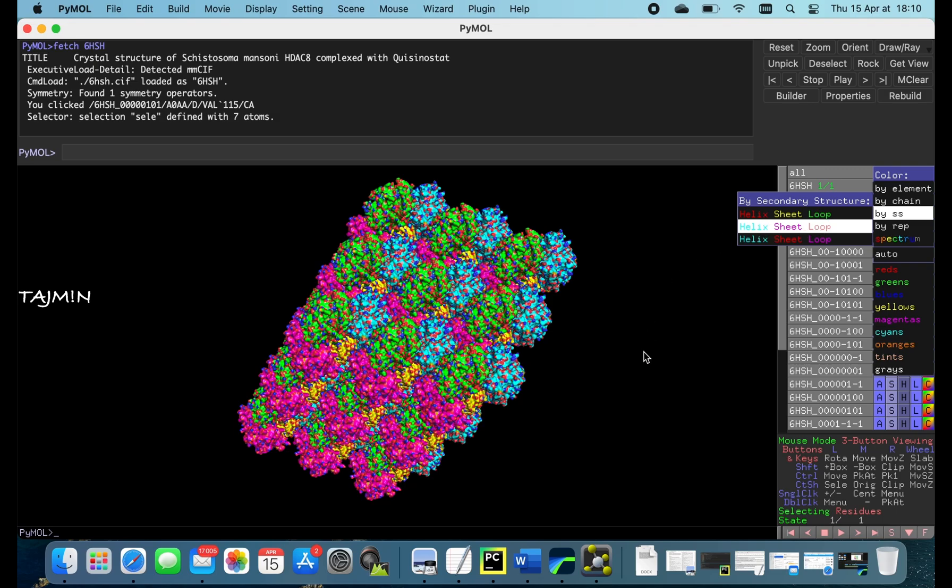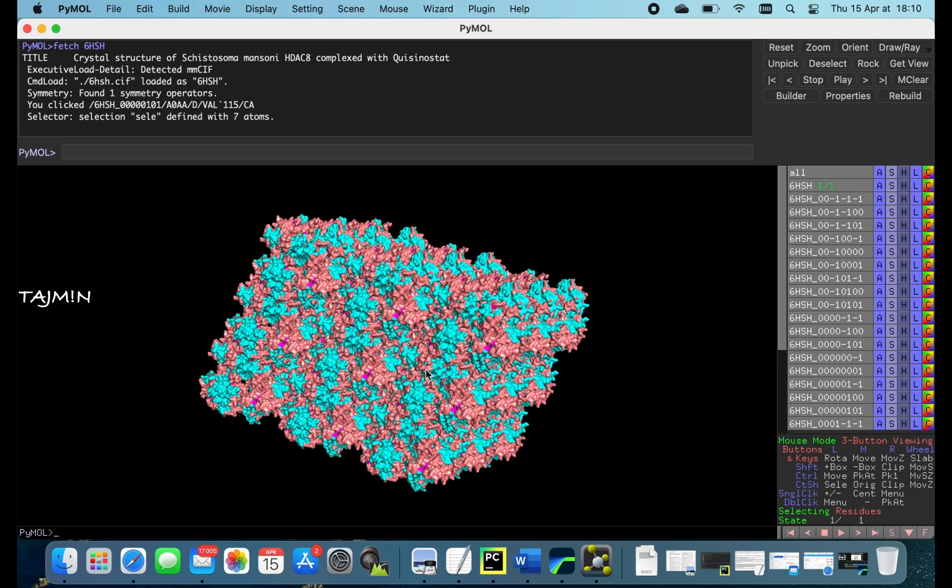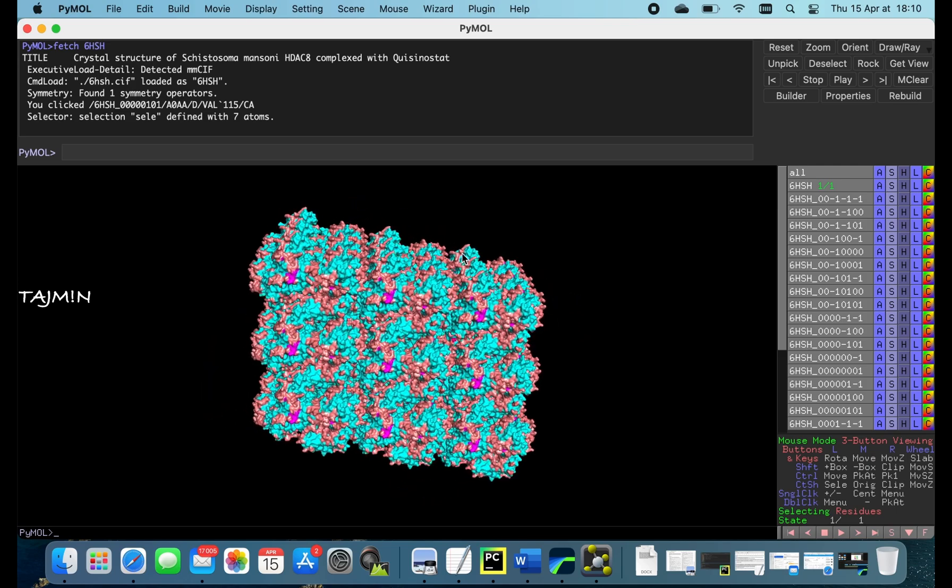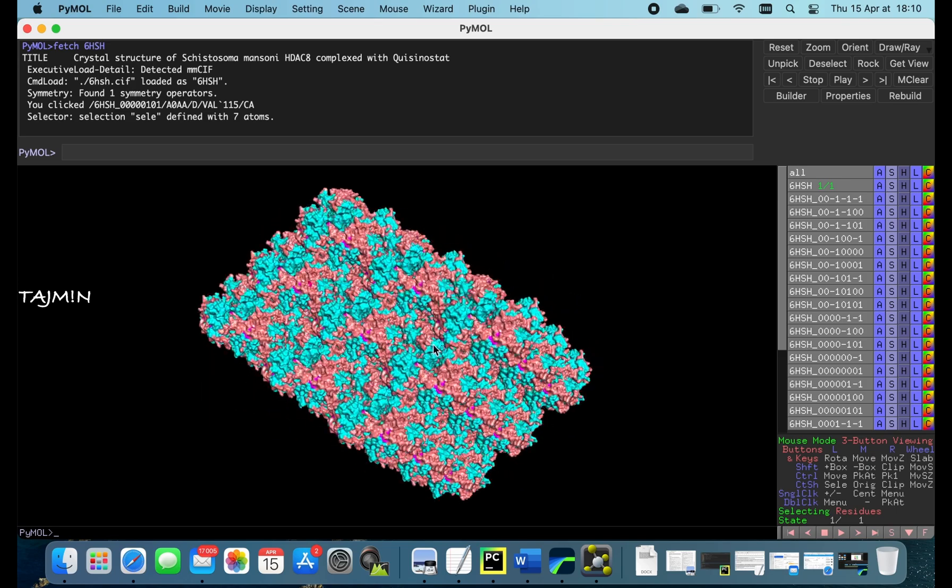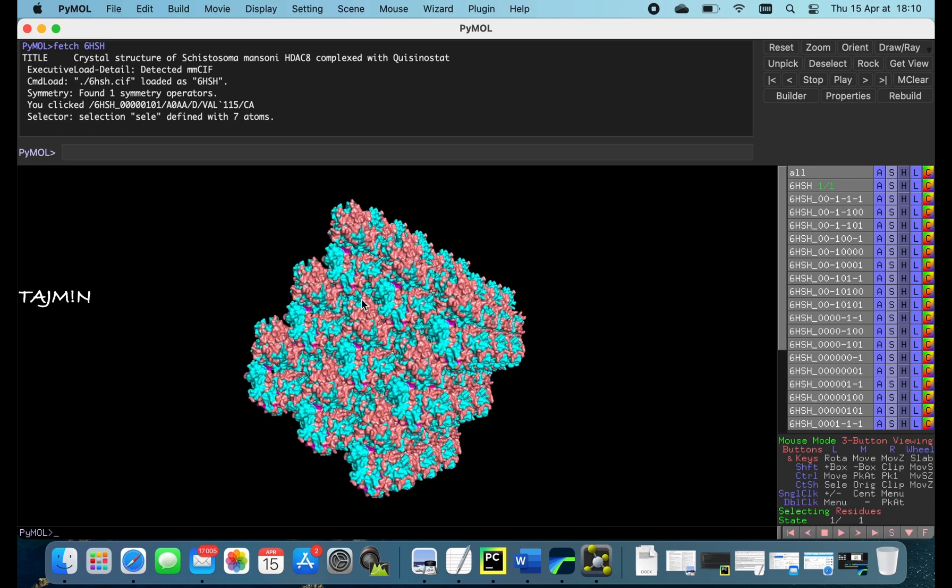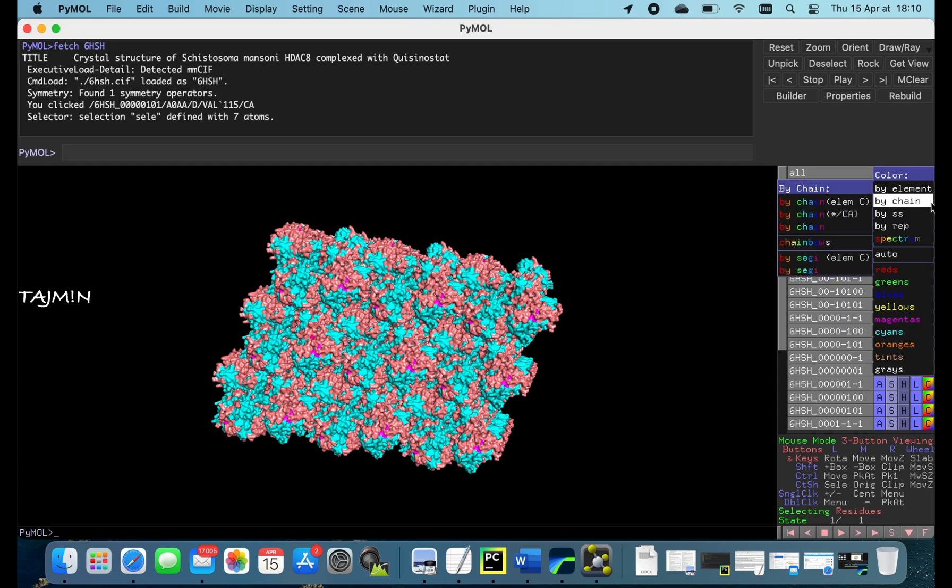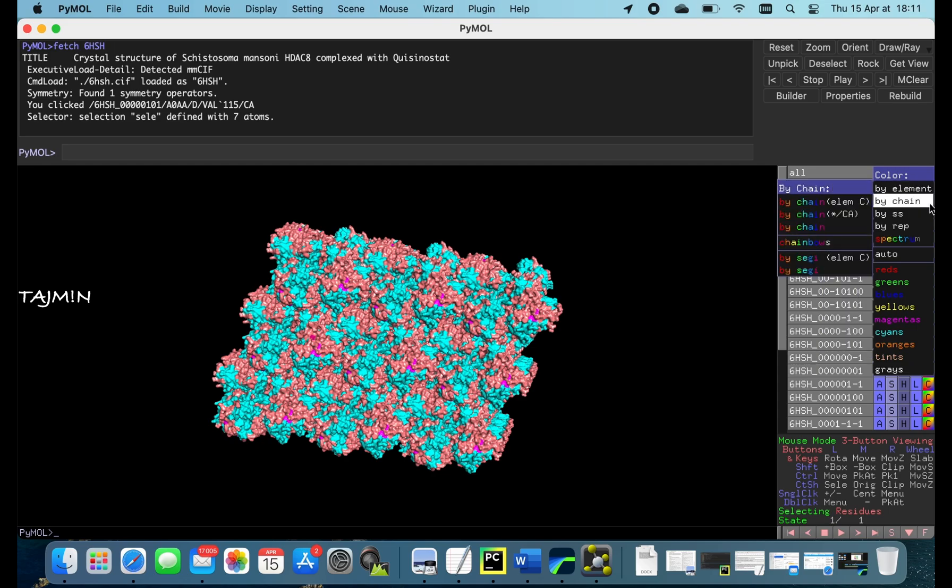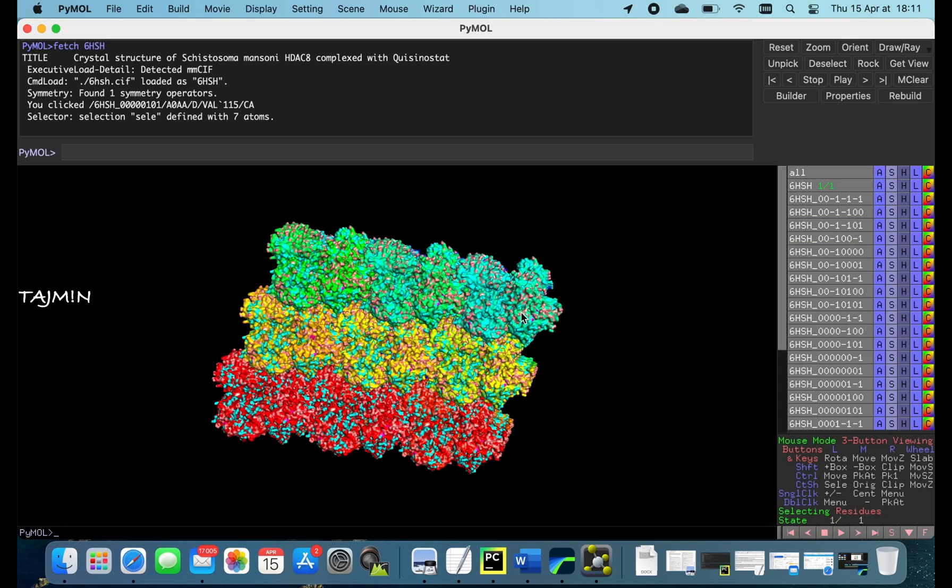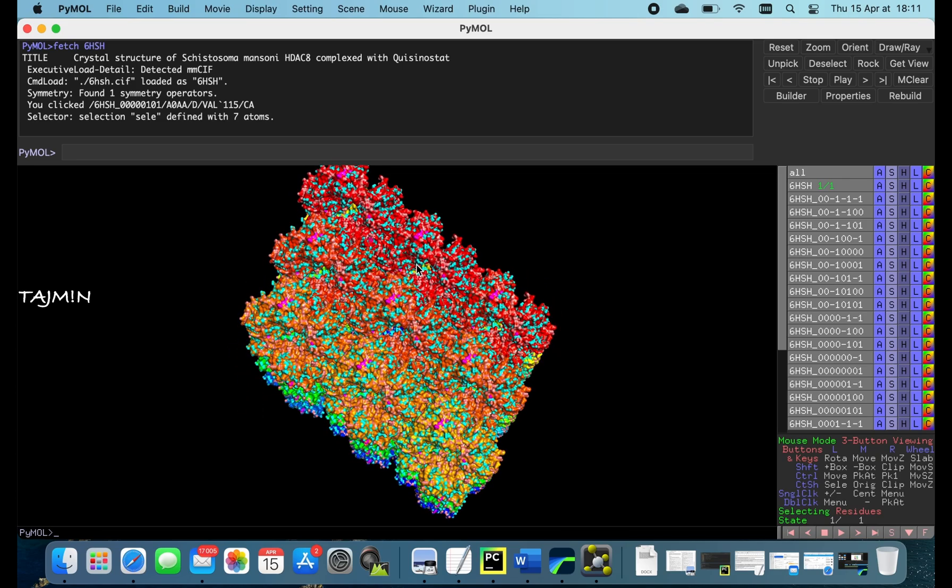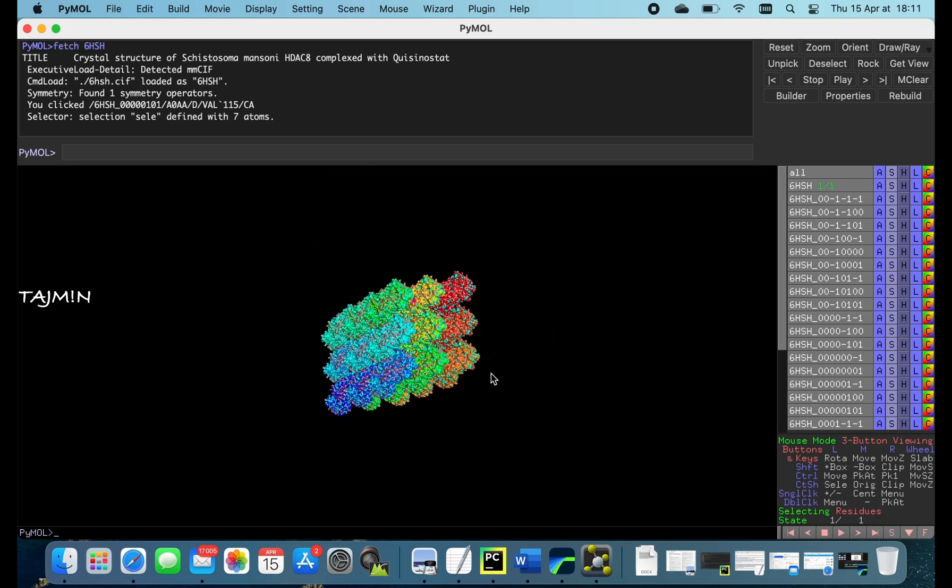I'm going to change the color to show you how quick it works in the surface representation. It took a second to change the colors. Let me try one more time. Change color to spectrum. Yeah, it took a second or two again, but smooth again in rotation.